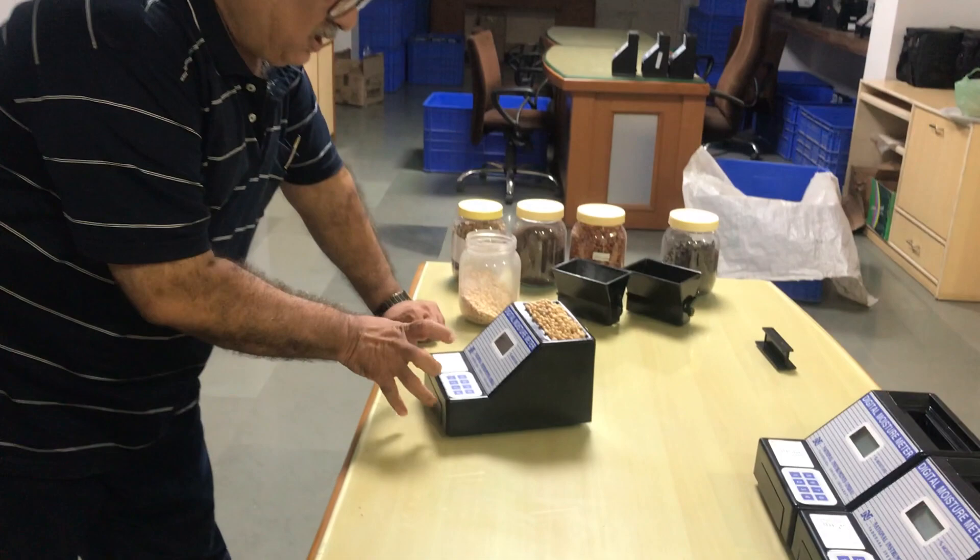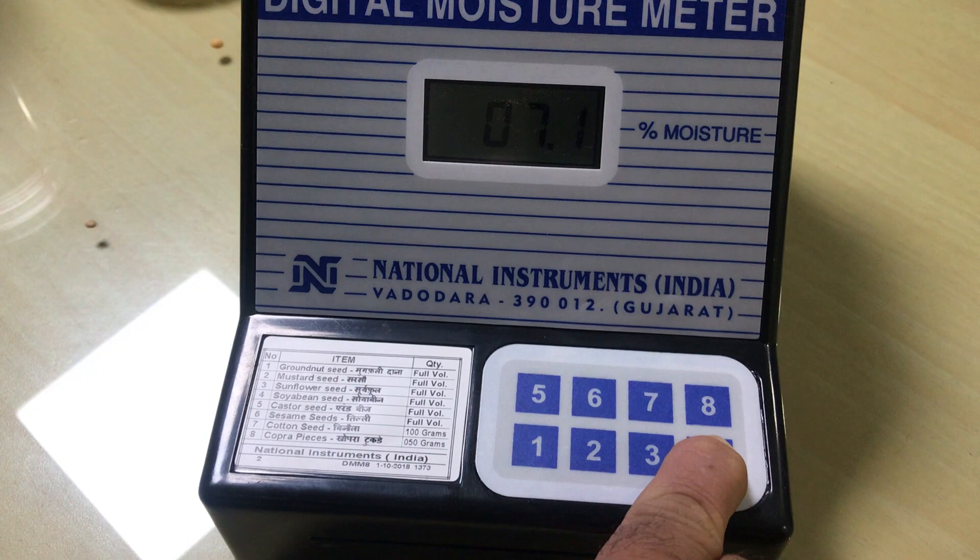Now, the core number key is calibrated for the soya bean seed. You have to press the key until the reading gets stable.